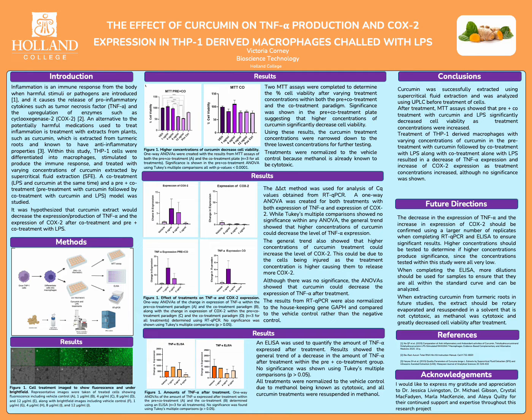After treatment, representative images were taken to show fluorescence along with the cells under bright field. This allowed for the visualization of the treatment and to show that there was the same number of cells in each group, just more or less treatment. The images include the vehicle control and curcumin treatments of 1, 4, 8, and 12 microgram per mil.